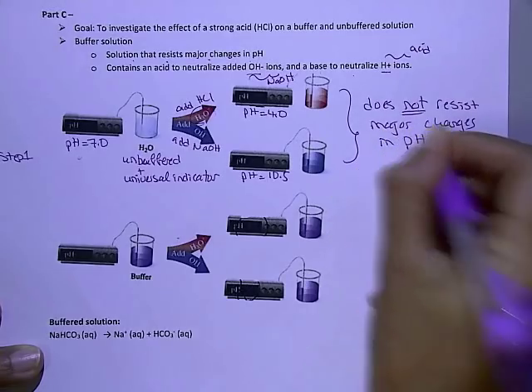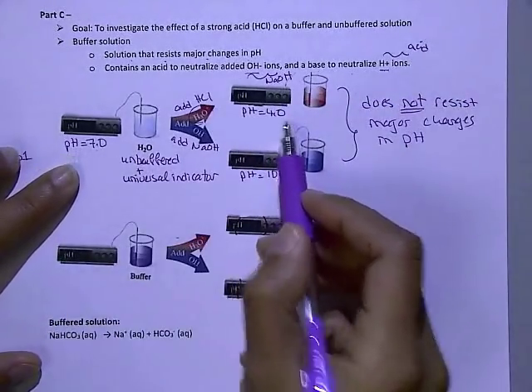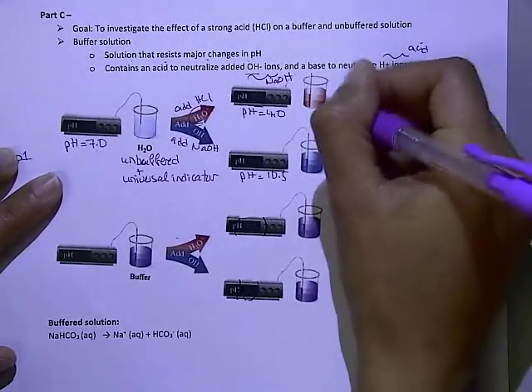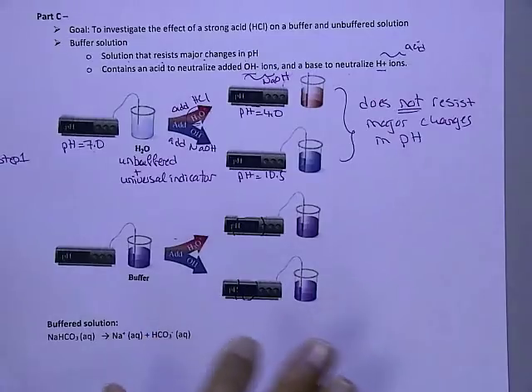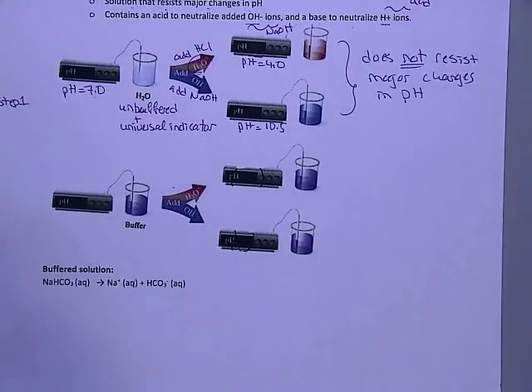In pH. And again, because we're seeing pH actually change. If you had a buffer solution, your pH should not change. What you're going to see in lab is a color change. It might not be red and blue. I actually don't remember what it should be in lab, but pay attention to your colors. Make observations before addition of acid and after addition of acid.